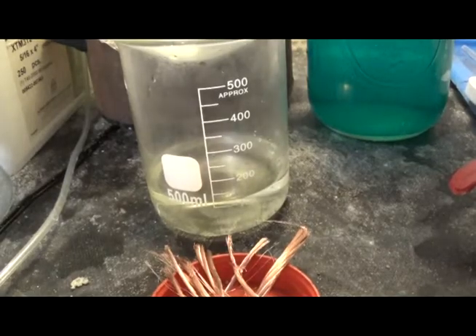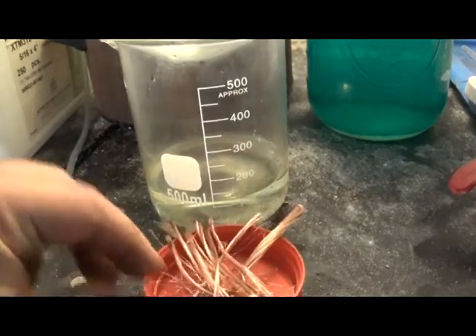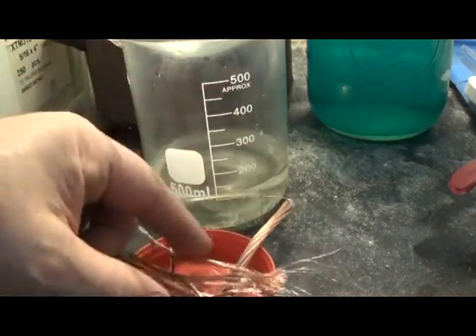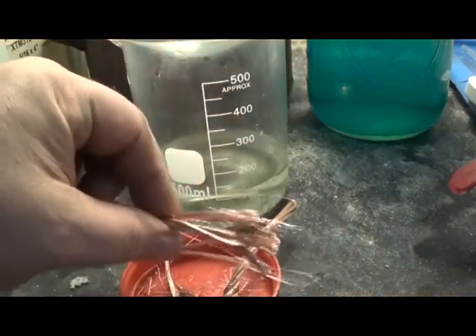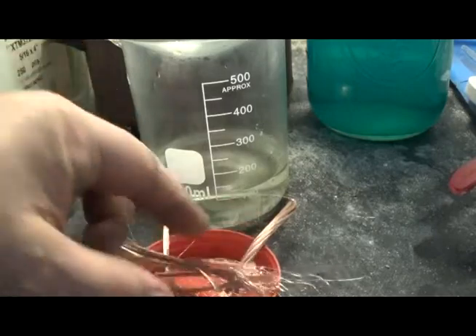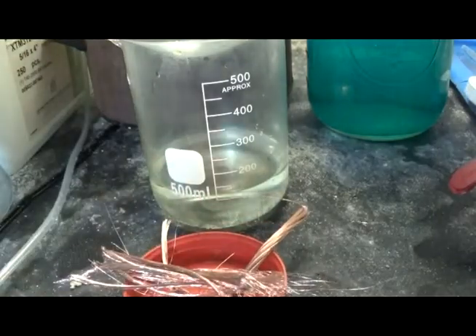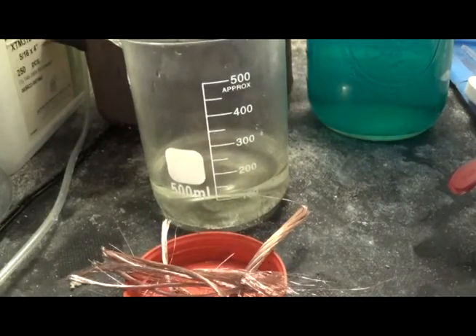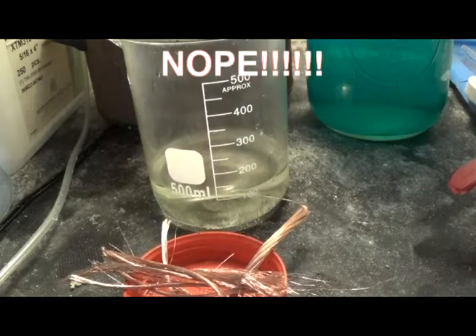Hey, what do we have here? Looks like some copper — very thin copper — some car amplifier power wire, some hydrochloric acid, and we're going to make some copper chloride.